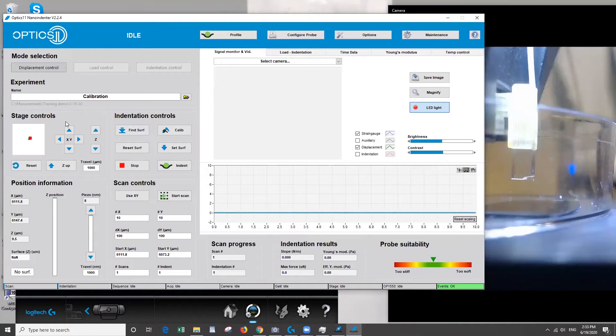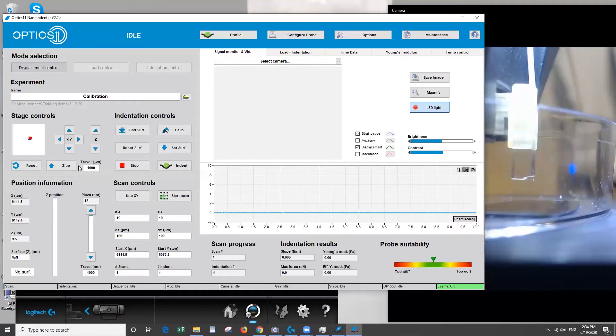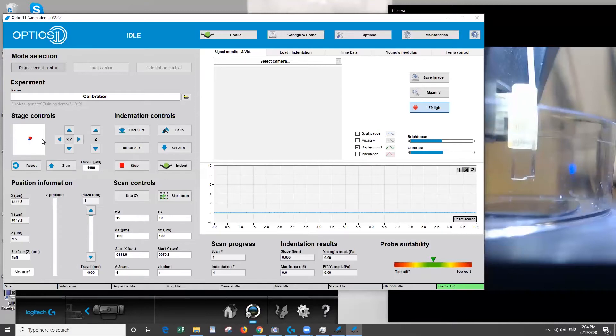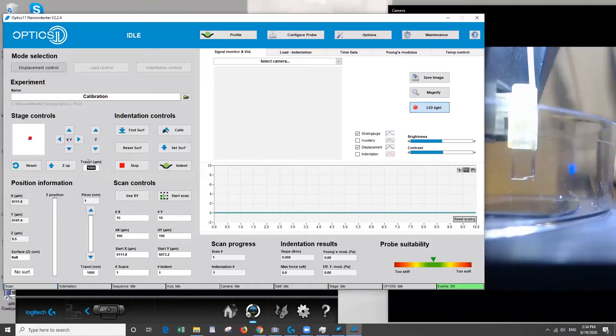Okay so the next thing we want to do is lower the probe close to the surface. So we'll come over here and use the stage controls. So this is a little map showing us where the tip is relative to the total size of the stage. Here you have x y in the buttons. This will move the stage in either direction and it will travel however far you type into this box.